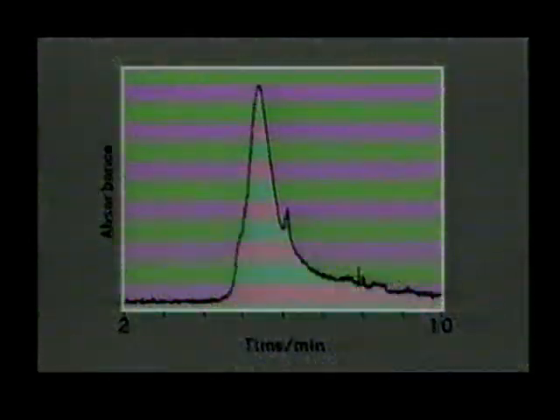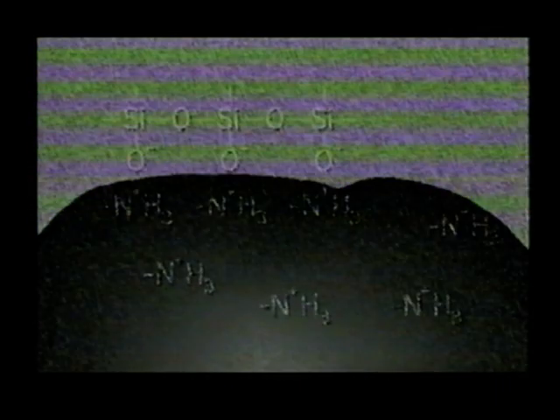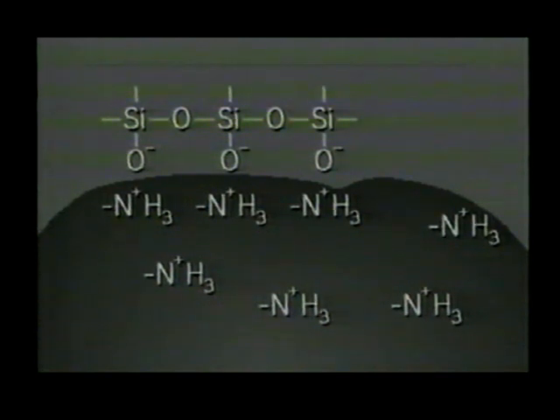Capillary electrophoresis is increasingly used for the separation of protein molecules. However, there is the problem that many proteins adsorb strongly to the walls of the capillary, causing peak broadening and sometimes loss of sample. Protein molecules bind so strongly to the capillary wall, since a protein molecule tends to have many charged sites over its surface. Cationic groups, for instance NH3+, interact strongly and cooperatively with the negatively charged silanol groups on the capillary walls.